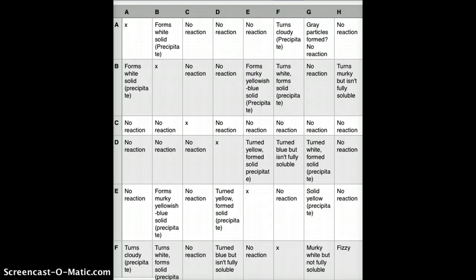We were looking for chemical reactions which are formed through energy being absorbed or released, otherwise known as endothermic and exothermic reactions. This way, the atoms either break apart or they form to create new substances. On the macroscopic level, we had to look for gas being formed, a precipitate, or color and temperature changes. After we mixed the substances, the results of the reaction and our observations were recorded.